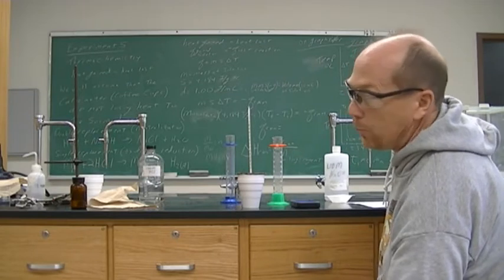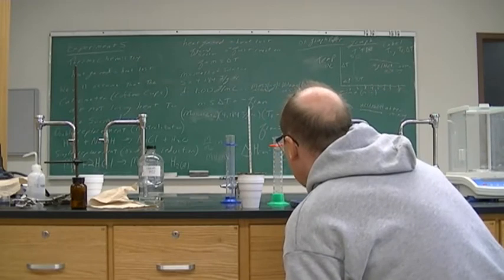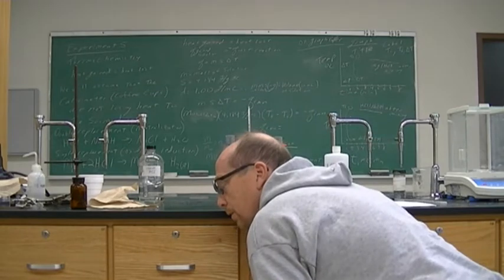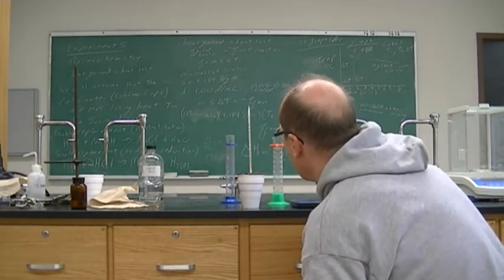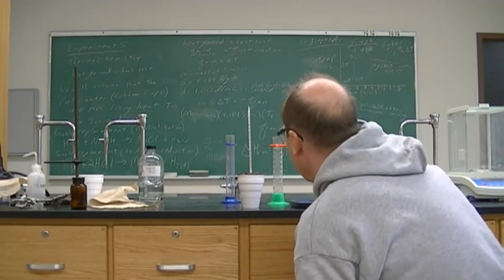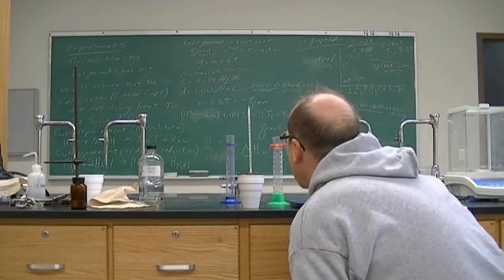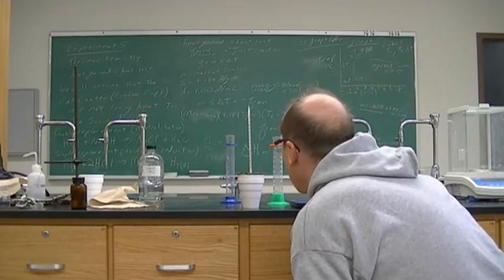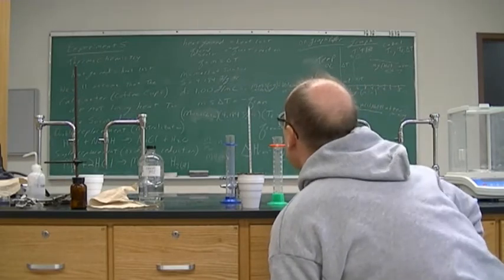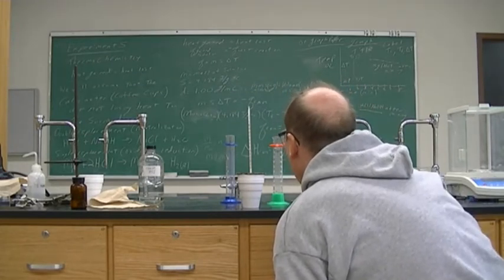Not a very exciting lab, watching the thermometer for 12 minutes. All right, let's see. So our calorimeter is working pretty well. I still hear a couple of bubbles, but it is holding its temperature at the 34 degrees Celsius. All right, reaching the 11-minute mark. 11-minute mark, we are still at 34.0.